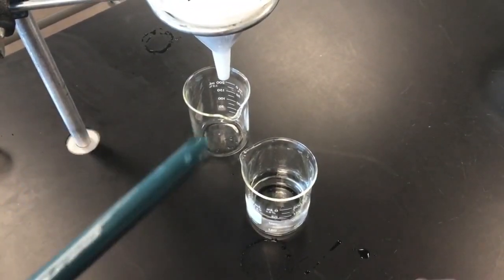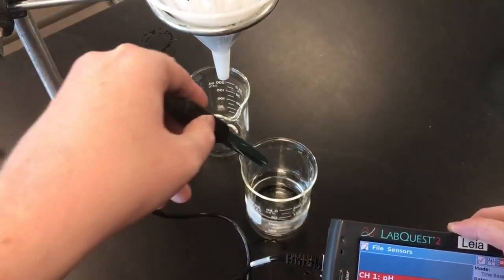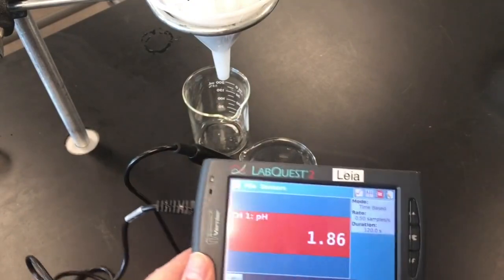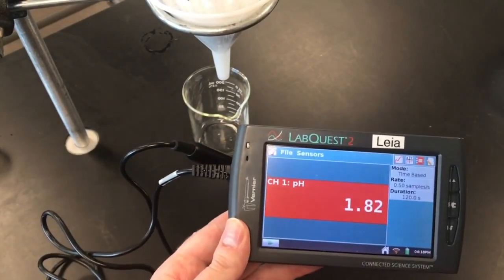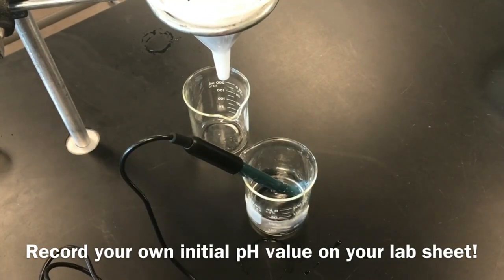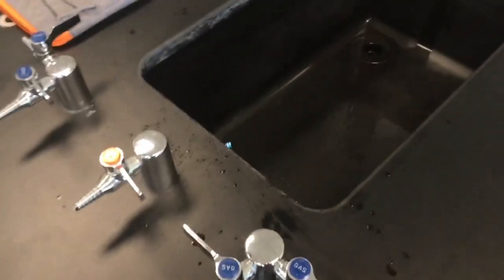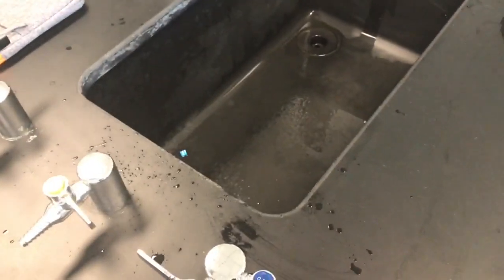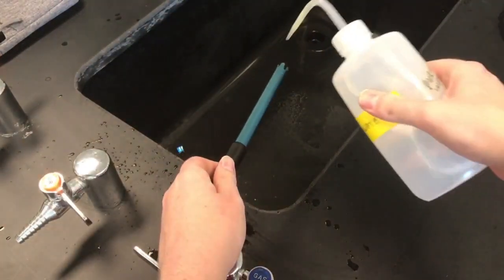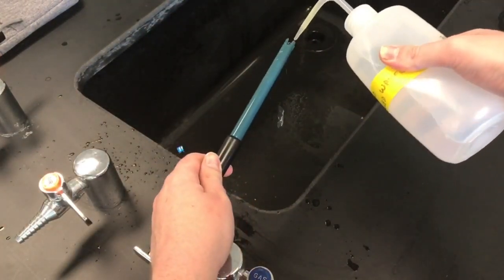And then I'm going to take an initial reading. So this is the initial pH of my sulfuric acid solution. It's going to give you a live reading. Just record when it starts to stabilize. Again, I'm going to spray this off when I'm done using it.